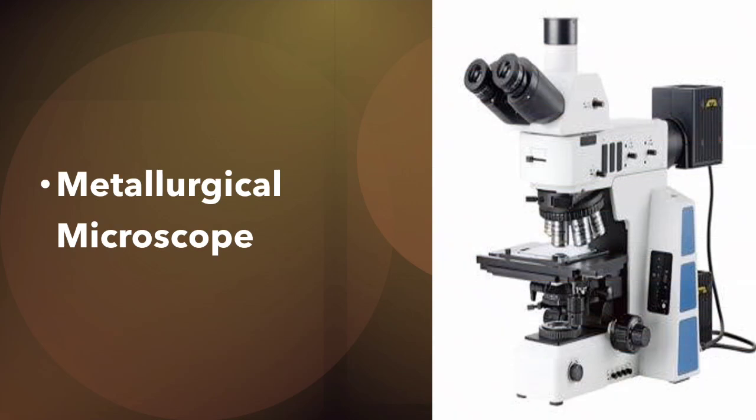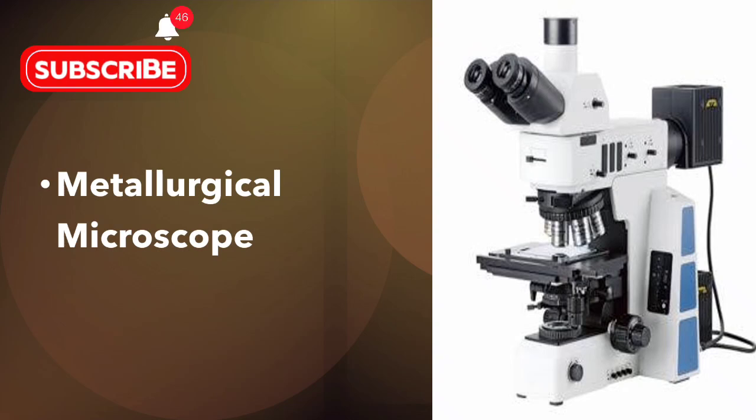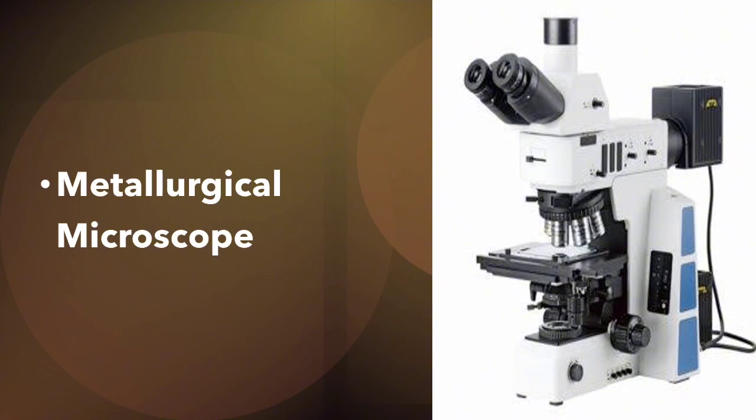You can see all of them are compound microscopes. Yes, all of them are, apart from the electron microscope. That one is a different one. I'm still going to expatiate on that. All the ones I've mentioned earlier on are compound microscopes, because they make use of two lenses. One lens is the eyepiece lens, and the other is the objective lens, just to compound the image, just to make the image more pronounced. So that's why we call it a compound microscope, but different types, right?